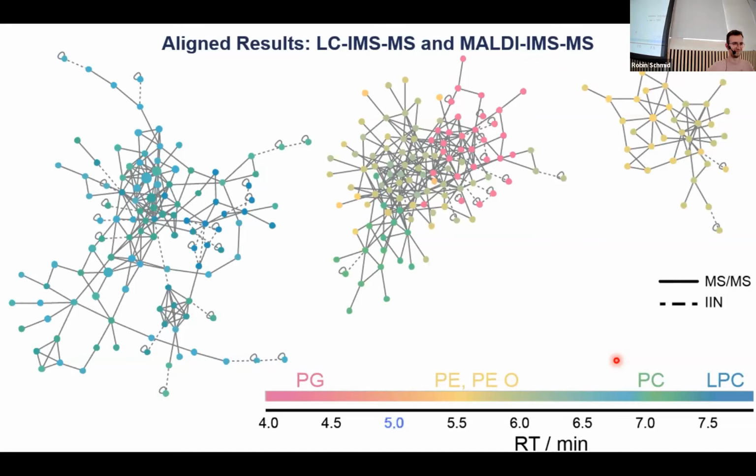And maybe, if someone already had some great experiences also. I mean, we use it in Uwe's lab in Münster also, and we had some great experiences of tuning the instrument to the last, and then really separating some different isomers, maybe even where on the molecule you can sometimes even tear apart the protonation sites and see that there's multiple different ways to protonate a molecule. And that can be very nice, and it can be just a lot of duplication of problems. Yeah. So, but yeah, we were definitely able to find great ways to separate compounds with it.